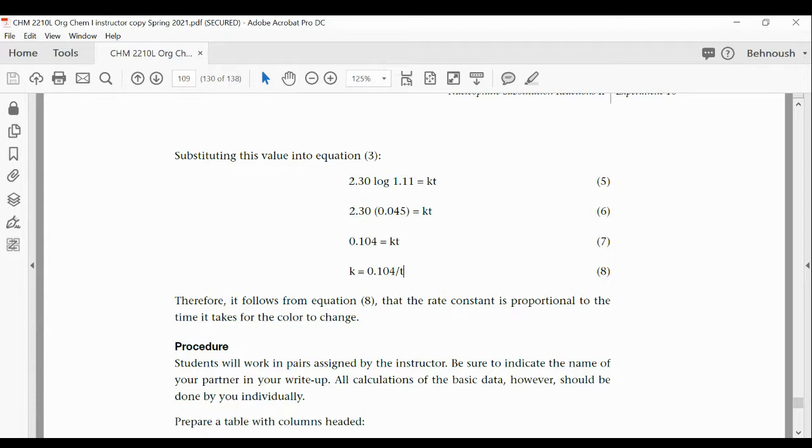But the simplified version of it, based on the design of the experiment, would be the use of equation 8. So we don't test you on your knowledge of logs and anti-logs and all that. So we make sure that it's a simplified version of equation 4. This is derived from equation 4, so the original one should work. And that's great that you got the same answers. That's perfect. So the only data that you are recording at this point is the time with different settings based on part A and part B of the experiment.